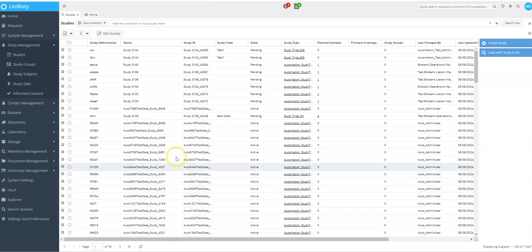One thing to remember is that if you use the general report, you will get every column that's available for study, but if you use the Explorer report after you've rearranged and reconfigured which columns you see, the Explorer report will only export the columns that you have shown on your screen at the time of the export.